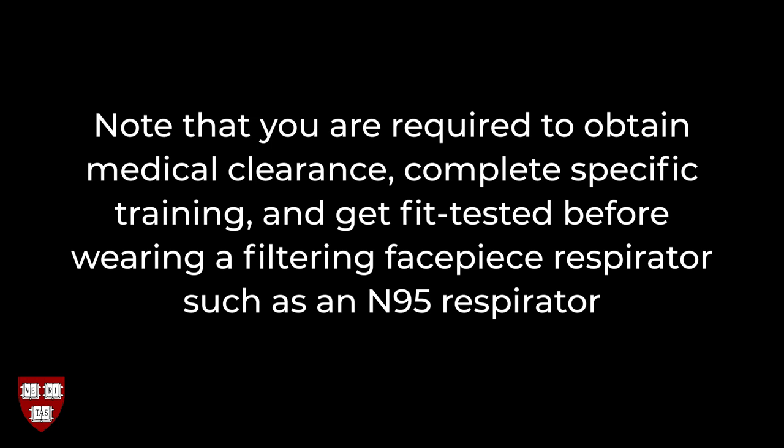In this case, don't proceed with your work until you talk to your supervisor and/or EHS. Note that you are required to obtain medical clearance, complete specific training, and get fit tested before wearing a filtering facepiece respirator, such as an N95 respirator.